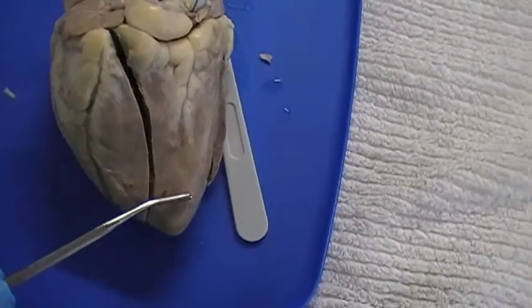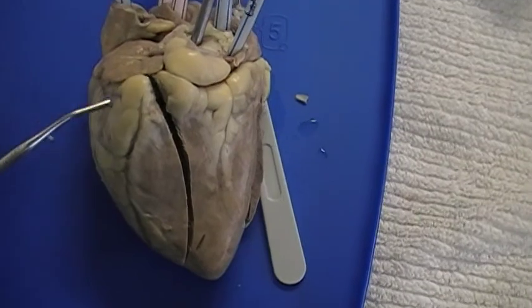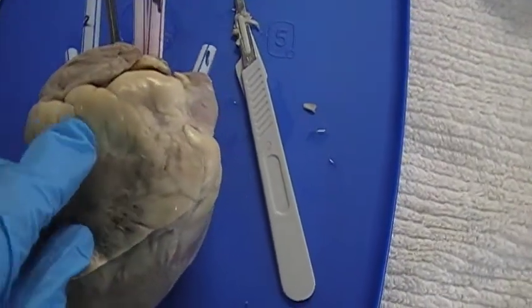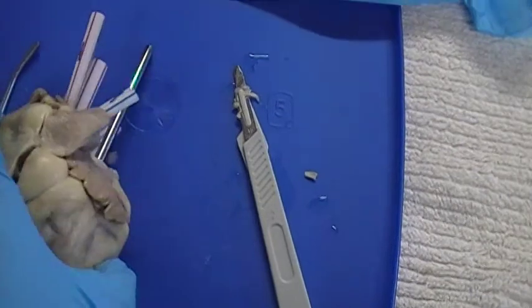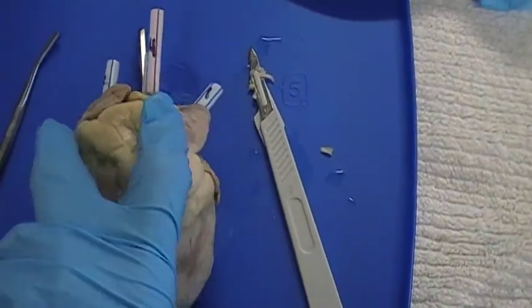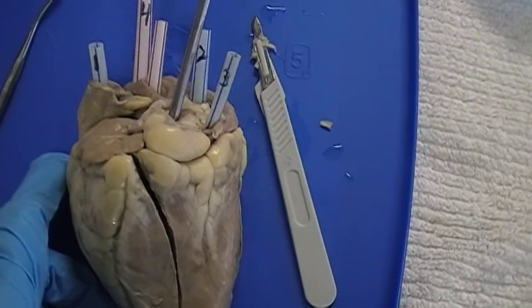The right and left atria. The left atria lies up here, and if I turn the heart over, the right atria is located right in this area right here. The blood in the right atrium is deoxygenated, and the blood in the left atrium is oxygenated.